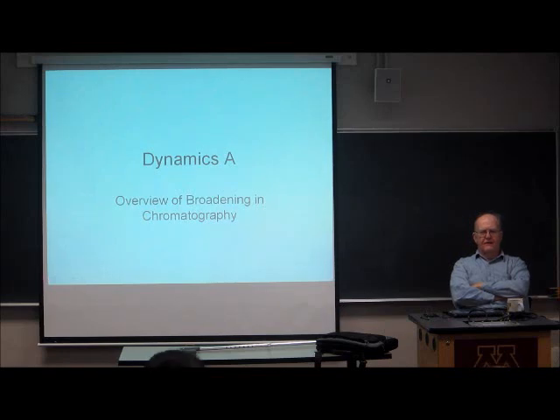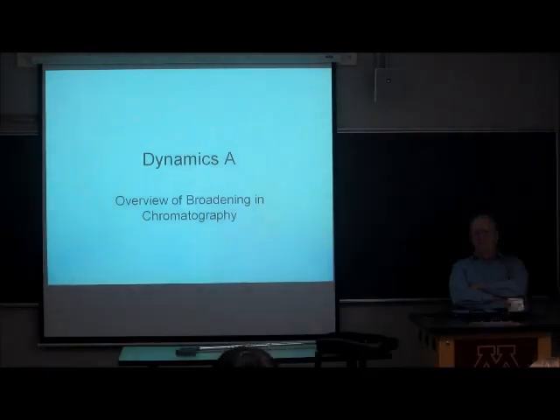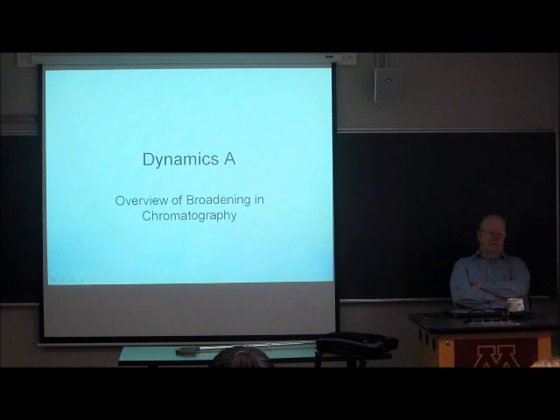About is the view of chromatography from outside the column, sort of a macroscopic view of chromatography. And today and for the next several weeks, we're going to be looking at a much more microscopic view of chromatography, and that is what's happening inside the column. And this is not a molecular level view, it's more of a view at, say, the stationary phase particle scale of things. But that's going to get us a long way towards understanding a lot of the processes that cause peak broadening.